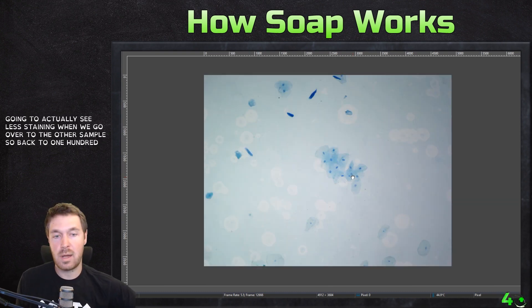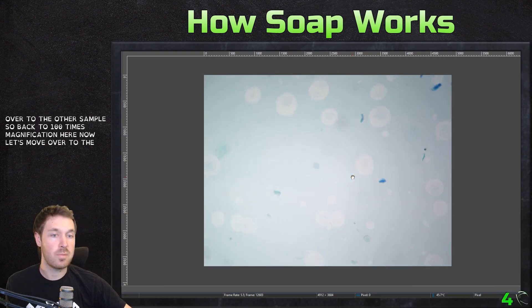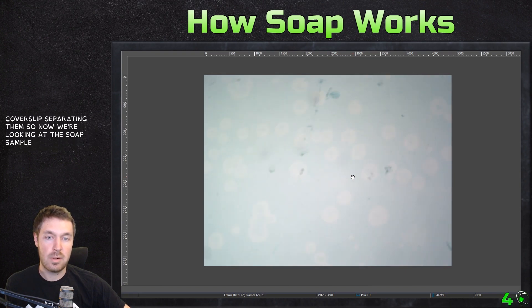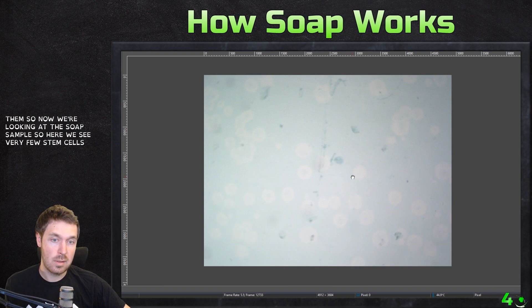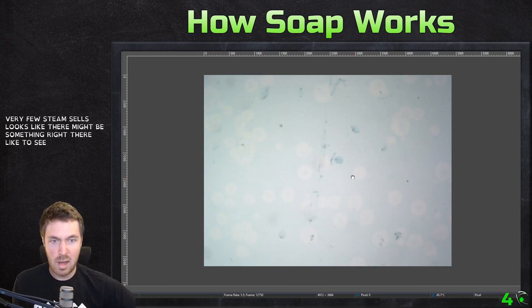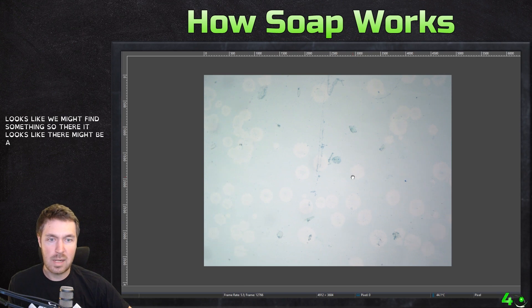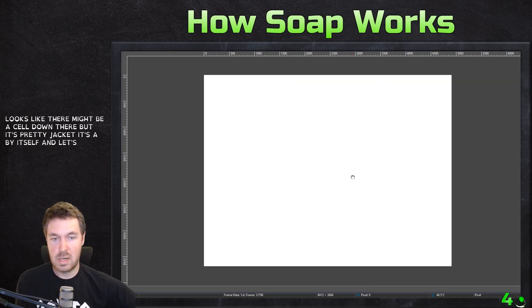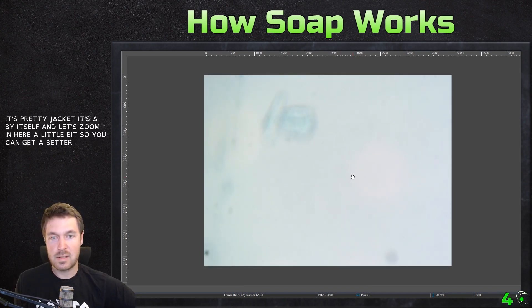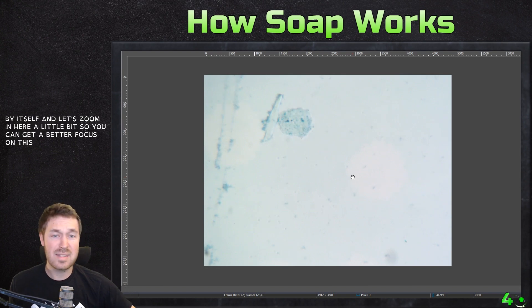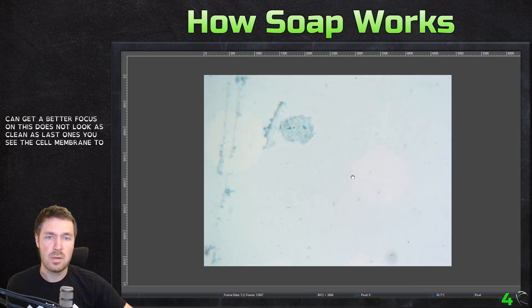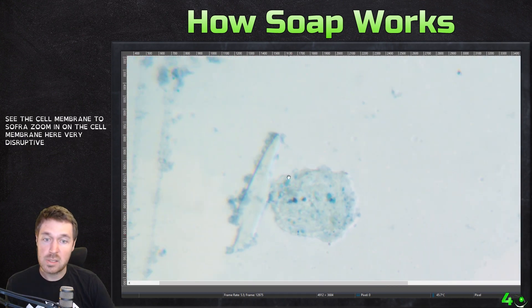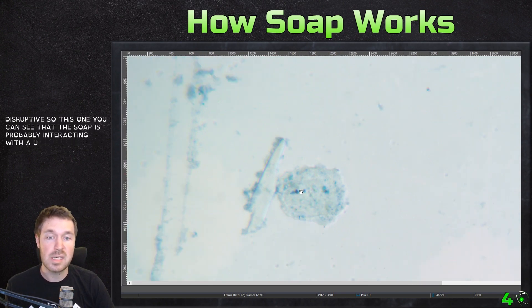So back to 100 times magnification. Now let's move over to the soap sample. So right here, this little break is the cover slip separating them. Now we're looking at the soap sample — here we see very few stained cells. There looks like there might be something right there — we might find something. There it looks like there might be a cell down there, but it's pretty jagged, it's by itself. Let's zoom in a little bit to get a better focus. It does not look as clean as the last ones. You see the cell membrane too — if we zoom in on the cell membrane here, it's very disruptive. You can see that the soap is probably interacting with it. You don't even see a stained nuclei in this one.